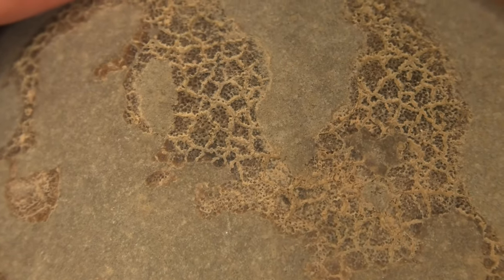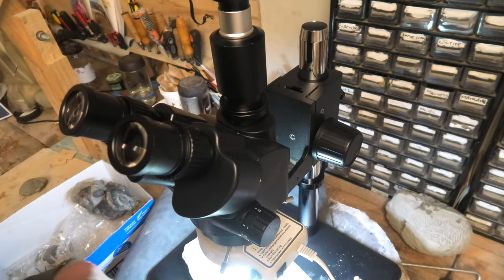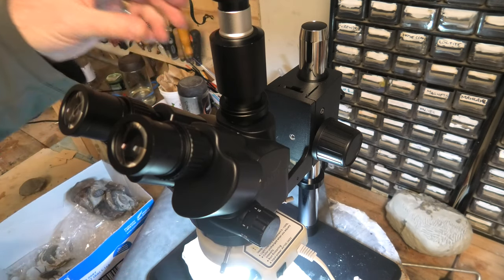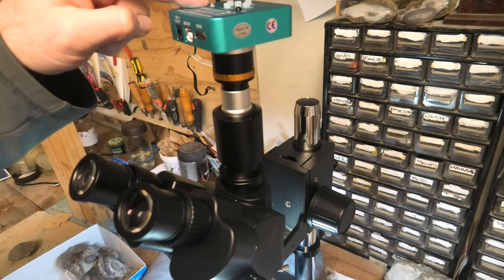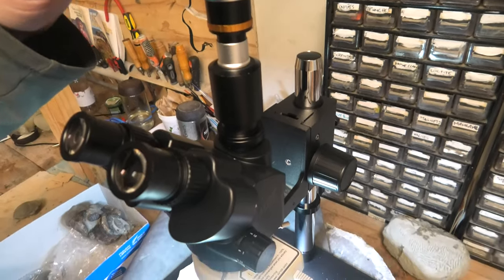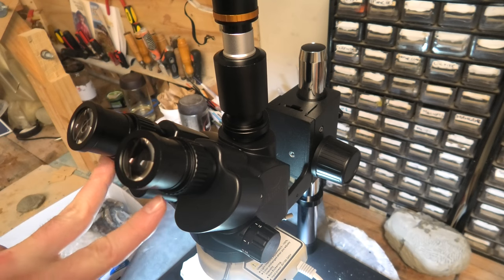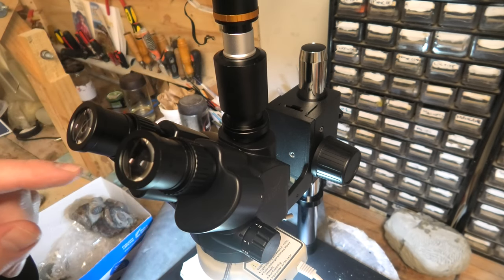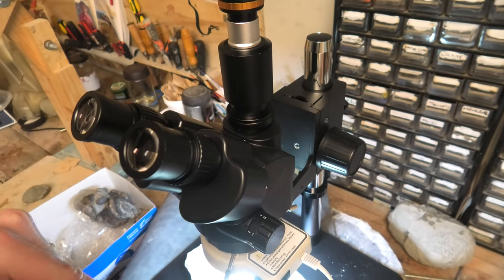It's really cool. Here's my new stereo microscope that I'm going to use to have a look at that block, hopefully containing some forams. And you can see it's got an extra port at the back here, and I've mounted a camera there. So that's a camera that's going through the back. What's really cool about it is that I can look through these two lenses and at the same time record, whereas before I had to stop looking through here and actually just put the camera through a lens.